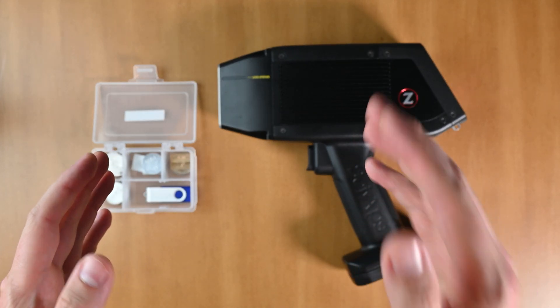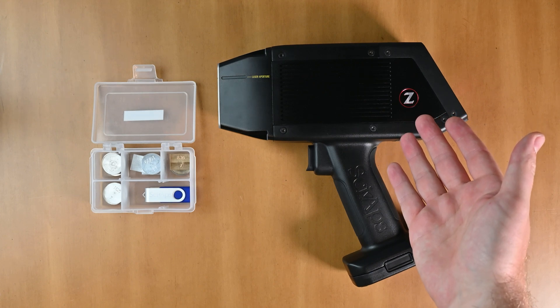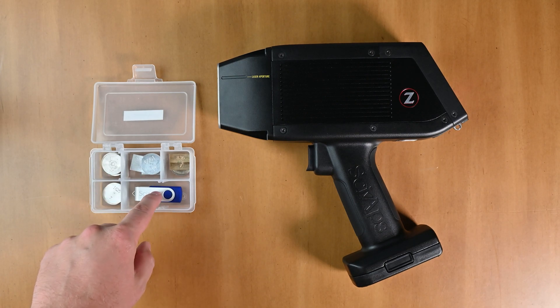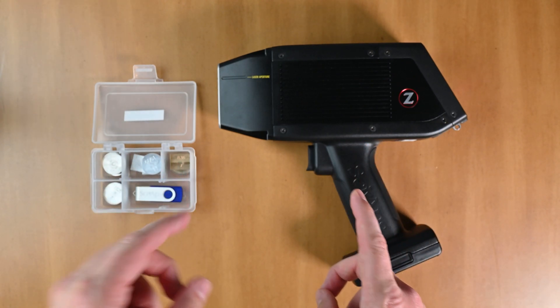In this video we're going to go through how to do drift correction with your SciAps Z series handheld LIBS metal analyzer. You'll need a couple of things — in your case you should have some drift correction samples along with your USB drive for your SciAps Z series. Without further ado, let's get right into it.